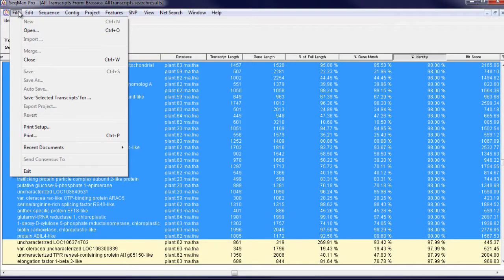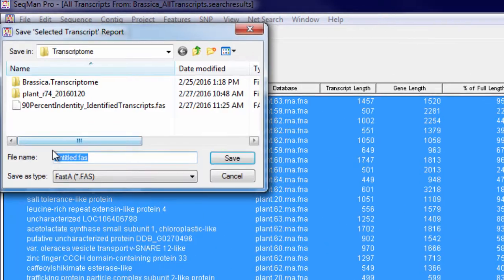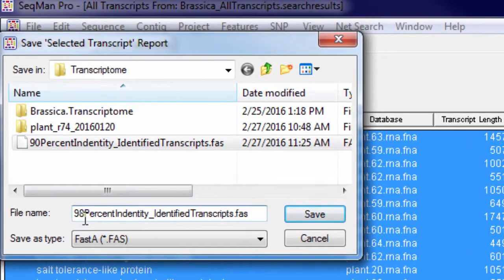You can also select subsets of transcripts and save a FASTA file to use as a reference set for RNA-seq analysis.